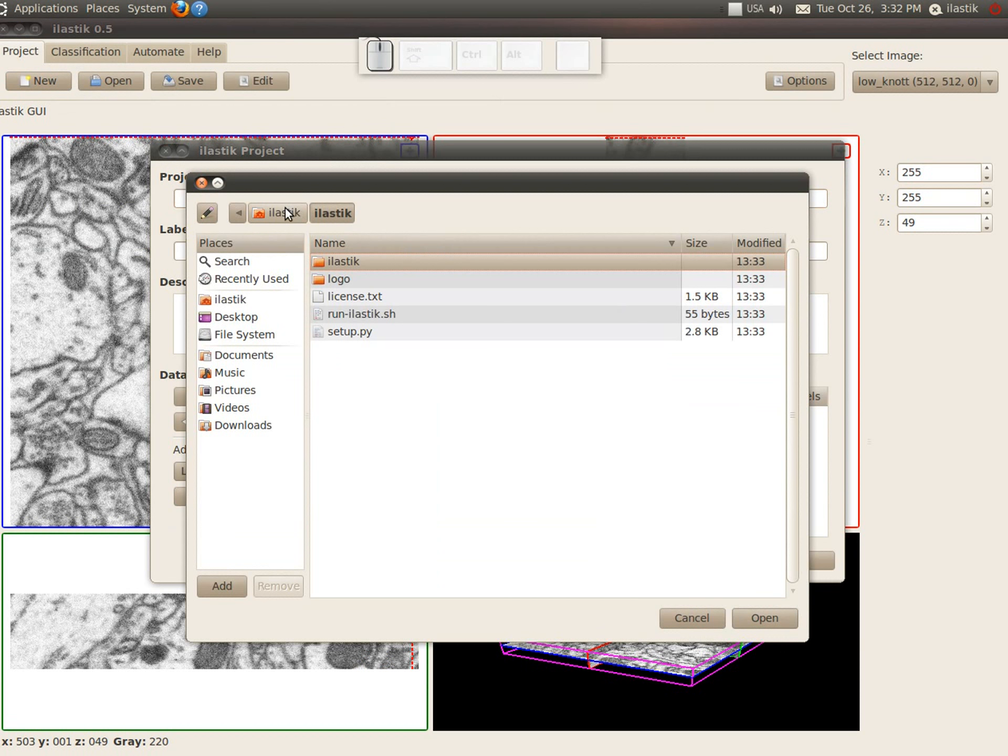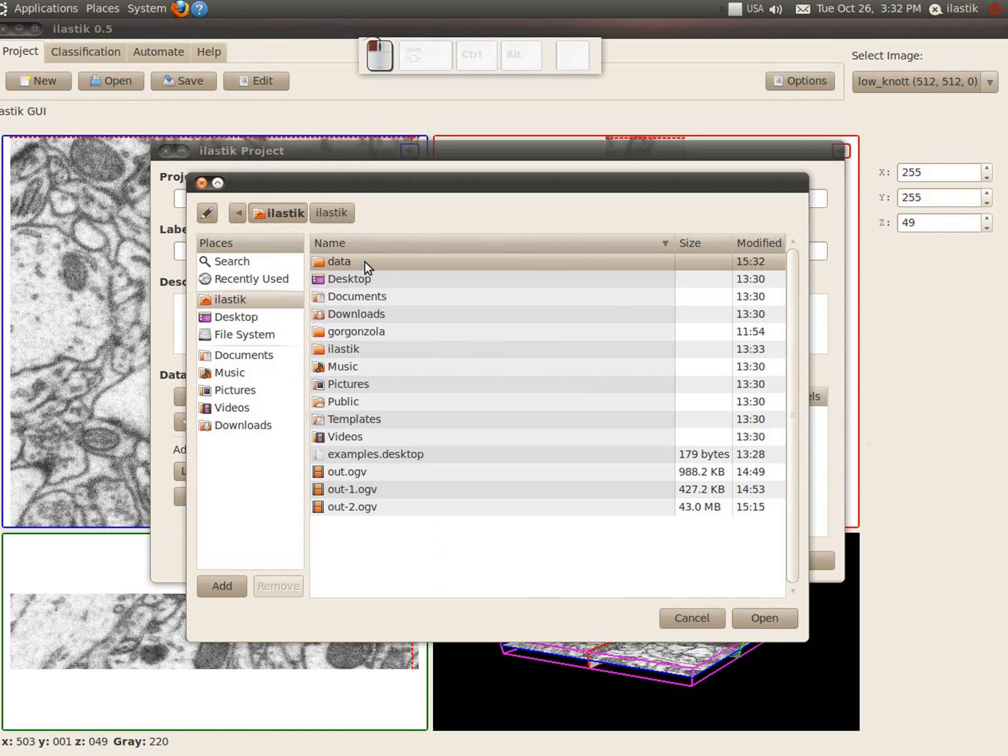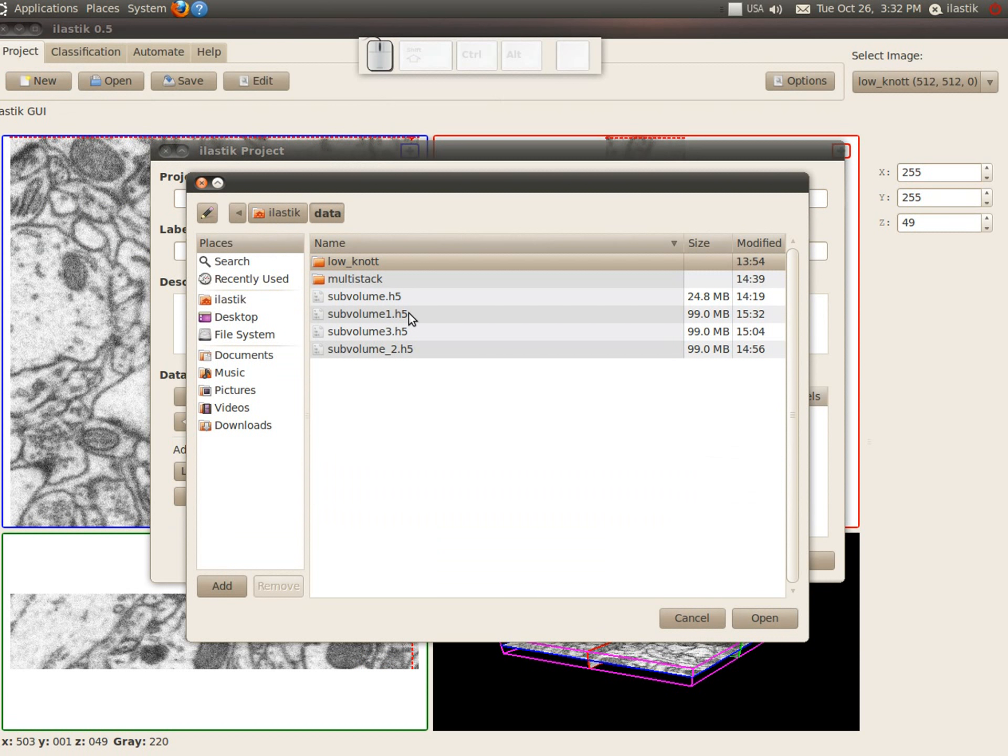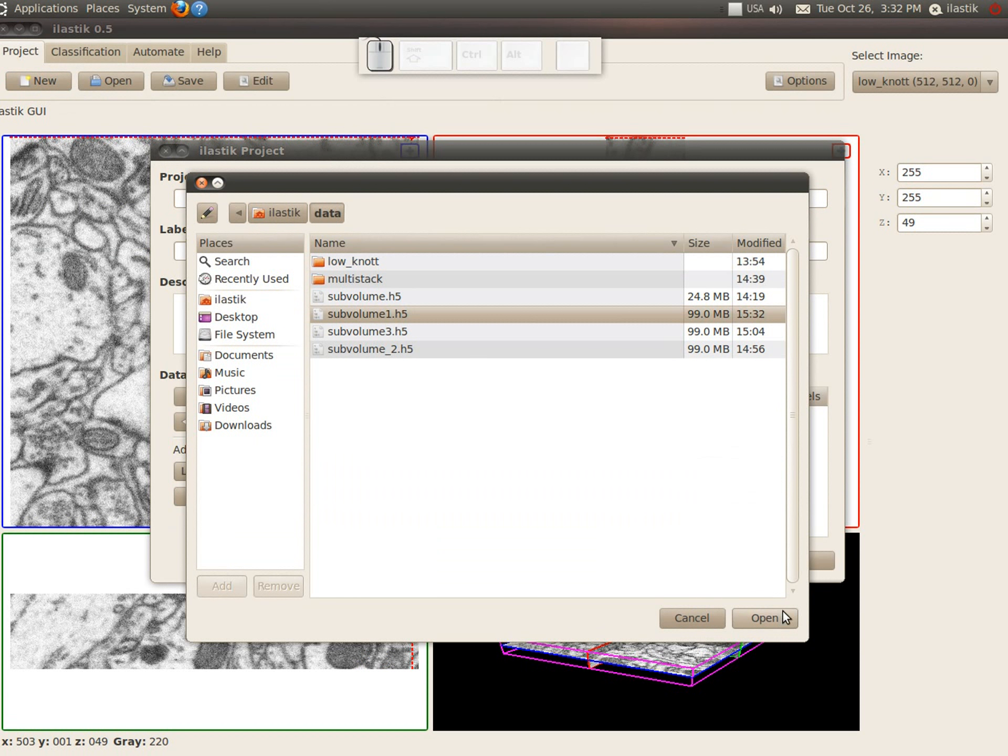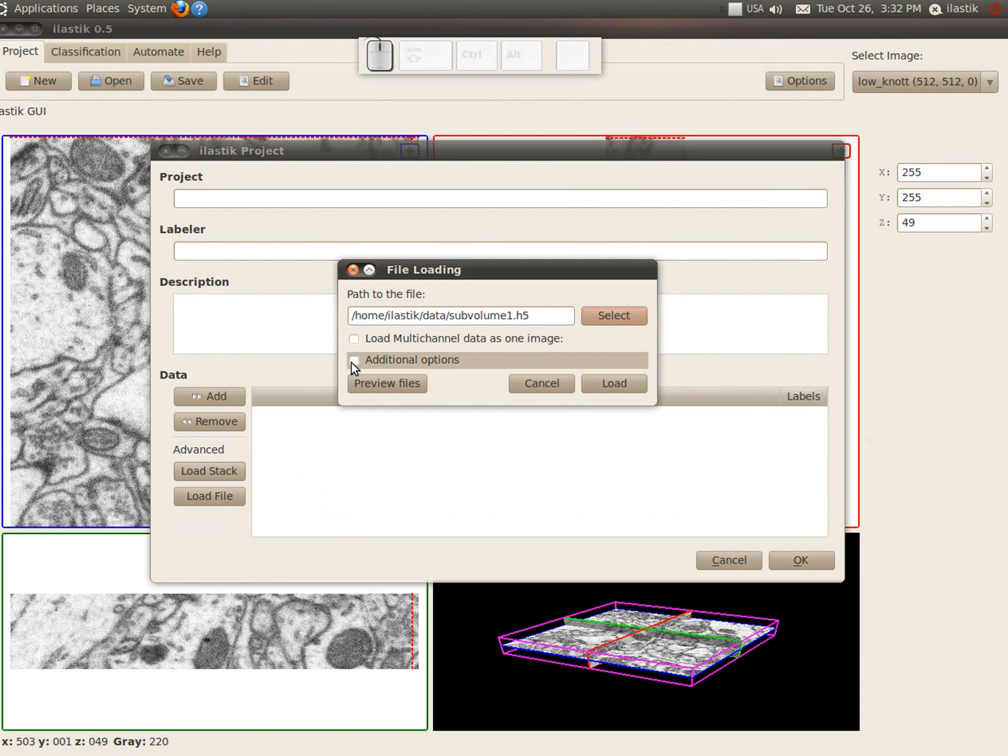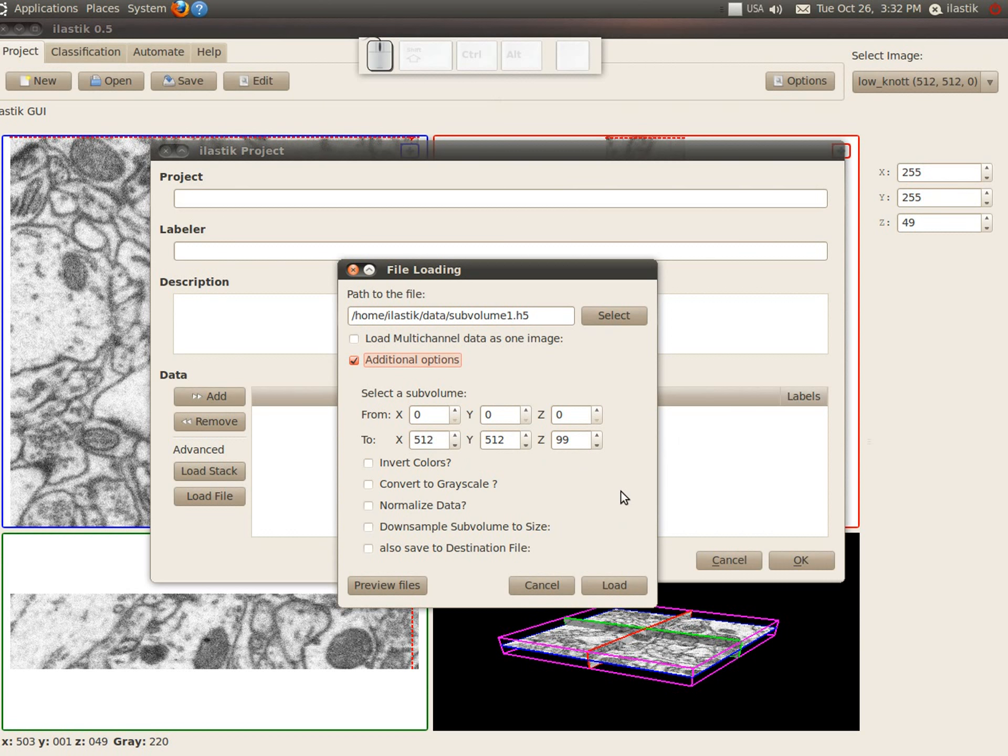So let's go to where we saved it. That was subvolume1. And if you click these additional options here, you actually have exactly the same options as you had in the load stack. Well, we don't need to use any of them anymore because the colors are already inverted and we already have a small subset, but if we wanted to, we could.